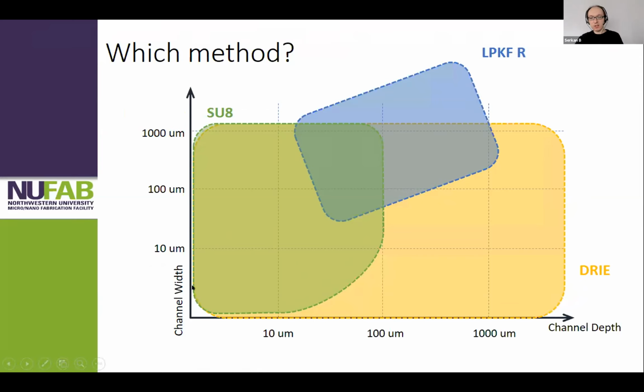But as it gets thicker, it gets really tricky to use, and you need to time your curing a lot better. It's less forgiving, I should say, because of the different stress on the SU8 film during curing, so it gets cracks and things like that.